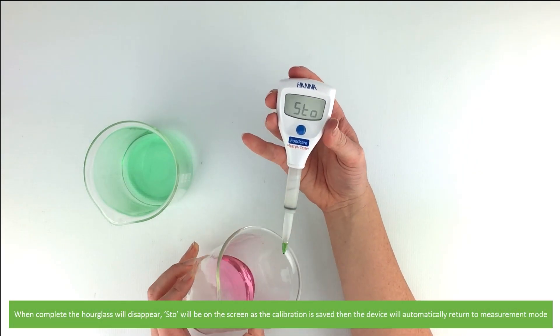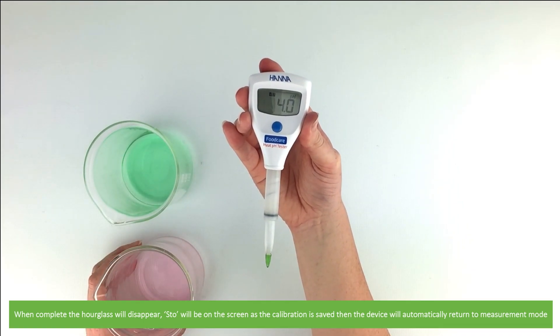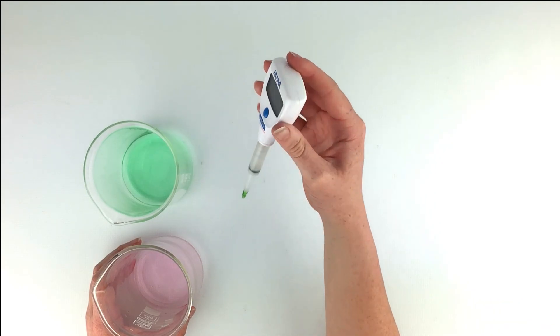STO will be on the screen as the calibration is saved, then the device will automatically return to measurement mode. The calibration is complete.